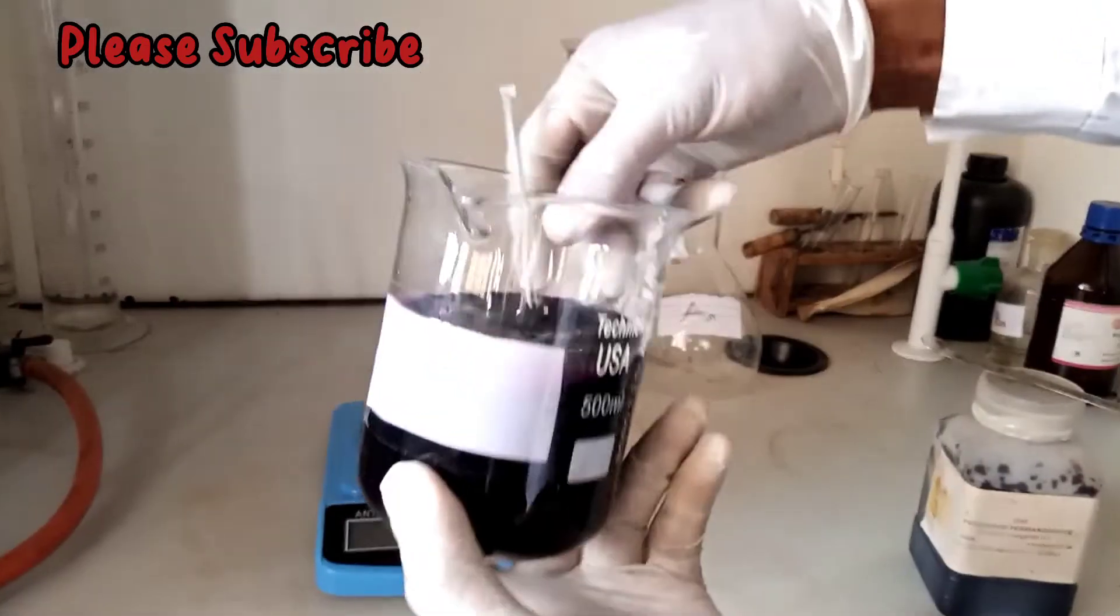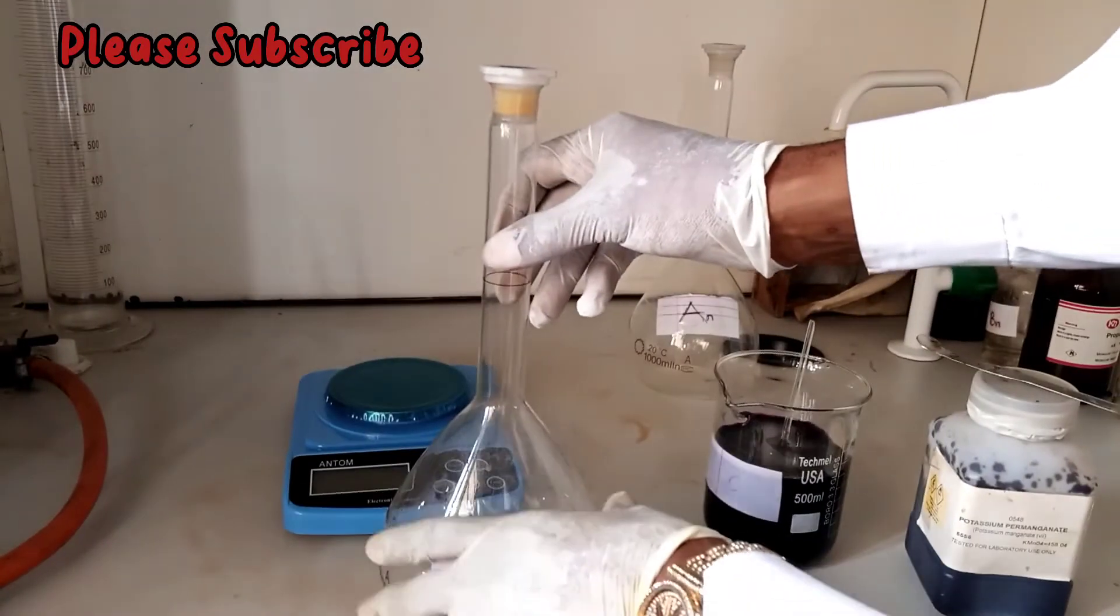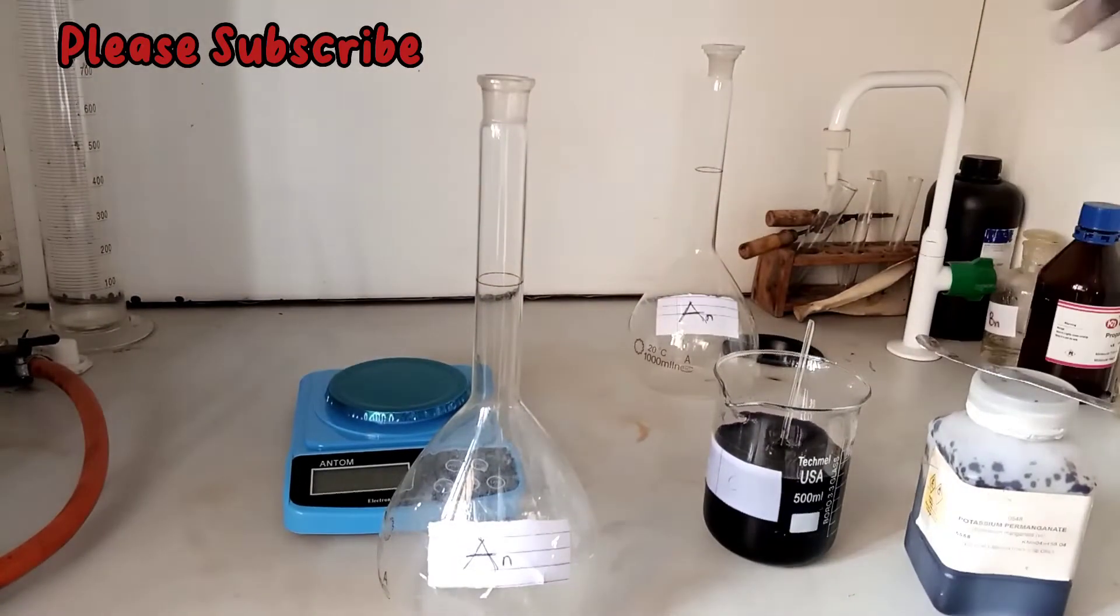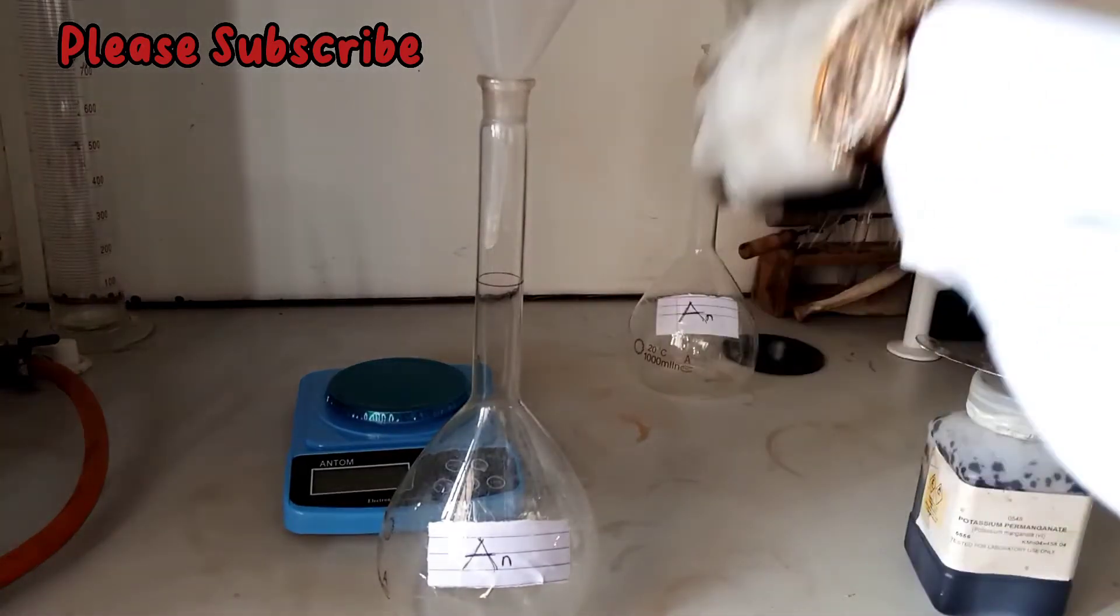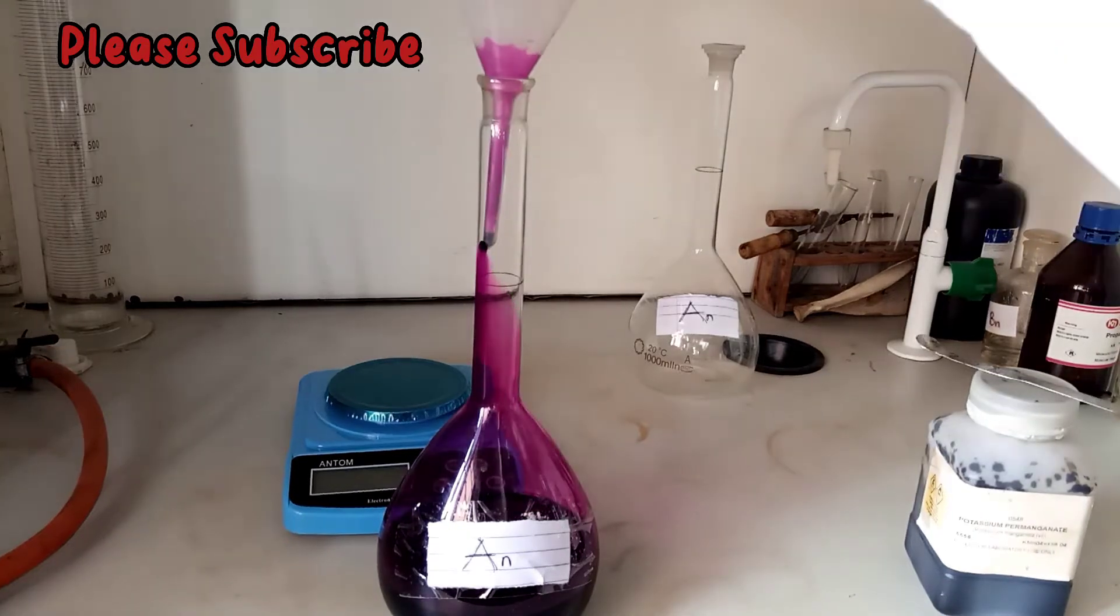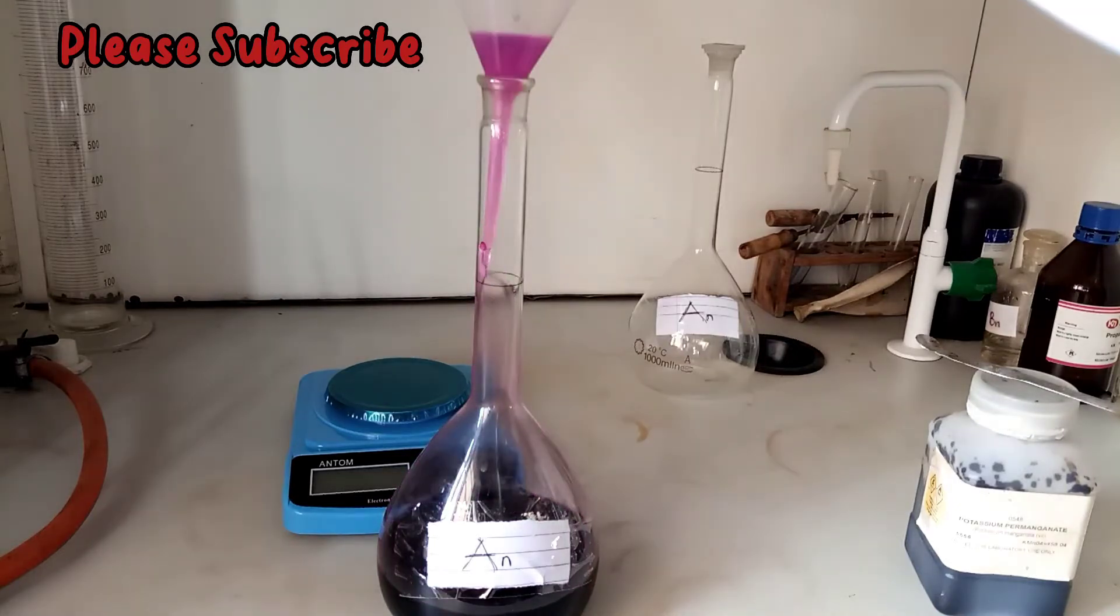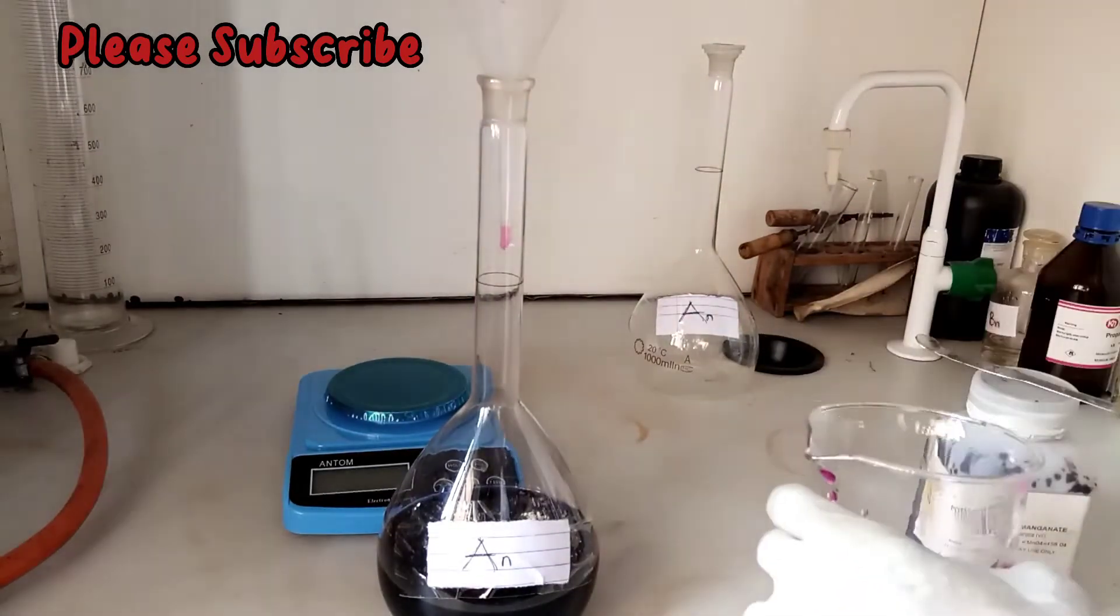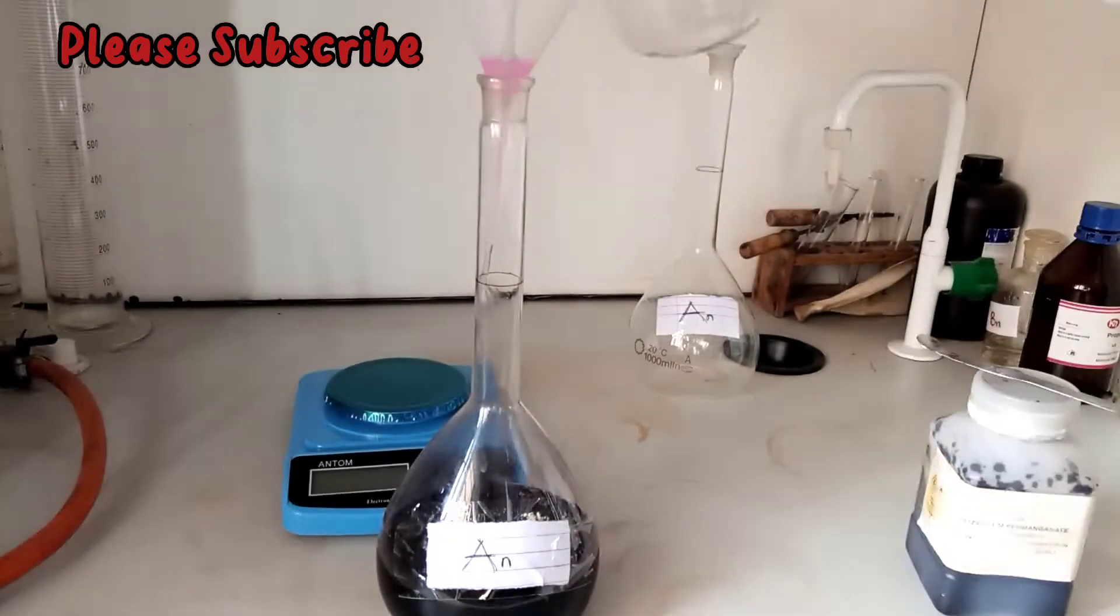After that, this is our standard volumetric flask. This is 1000 ml capacity. Dilute to 1000 ml by adding the prepared solution into it. You rinse the quantity left thoroughly into the standard volumetric flask and dilute with distilled water to the 1000 ml mark there.